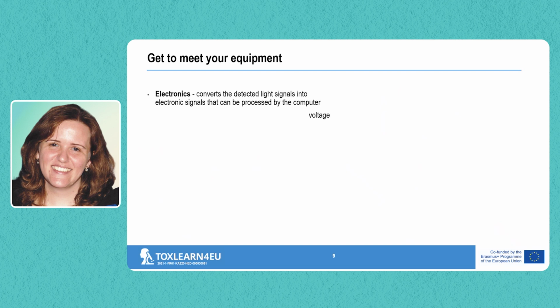You need to set up your voltage for a certain assay, and then you shouldn't move your voltage much from there. From day to day, in your experiments, you shouldn't move the voltage. You need to optimize the voltage in the beginning and then just use the same.